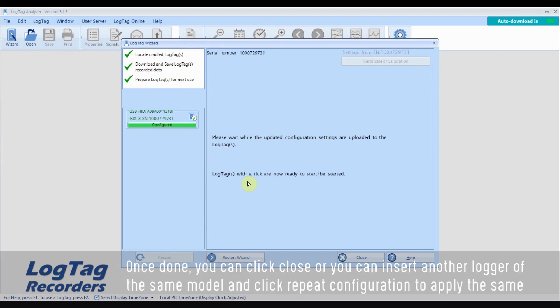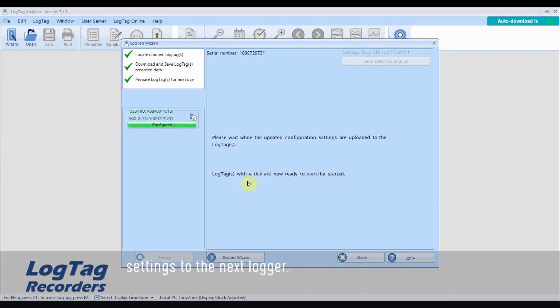Once done, you can click Close or you can insert another logger of the same model and click Repeat Configuration to apply the same settings to the next logger.